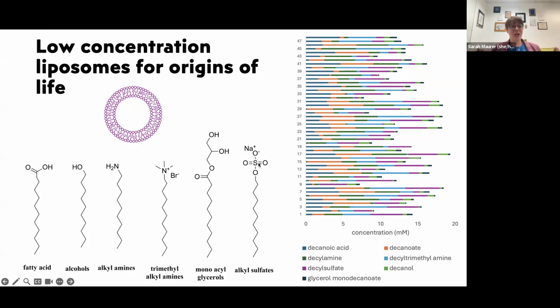And then we dry it out. So we make the plate in ethanol and then we remove all of the liquid and then we rehydrate with water. So it's a pretty good mixture of solubilized amphiphiles that are dehydrated. And then once they are rehydrated using the robot, we pipette up and down to mix them. So we're not sonicating them or anything. They're simply rehydrating in the water phase and then pipette to mix for automation purposes. And then we add the dye using the robot for microscopy.